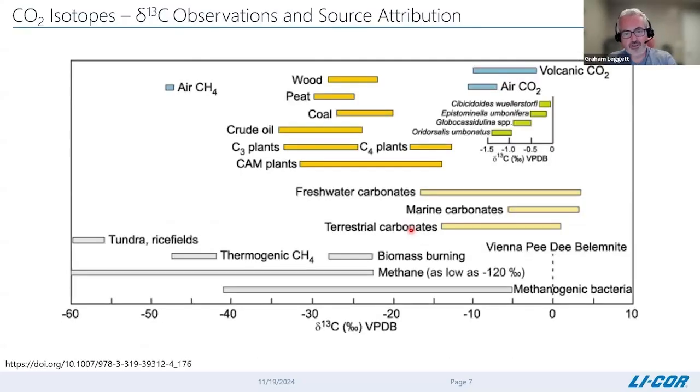And that's very evident if you look at the scale visually and where samples sit on that scale. So you can see here, I mentioned that physical standard, and that in this case is Vienna PD belemnite, which is, as I say, like a physical artifact that produces CO₂ with a known isotopic ratio, and that's deemed to be 0 on our scale. And then any changes relative to that standard can be clearly seen in the scale, and you can see now we can compare very readily from different sources.